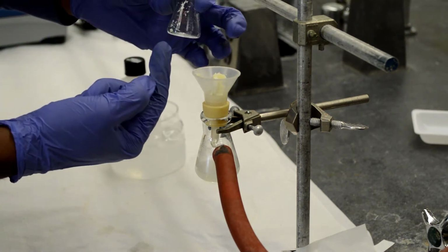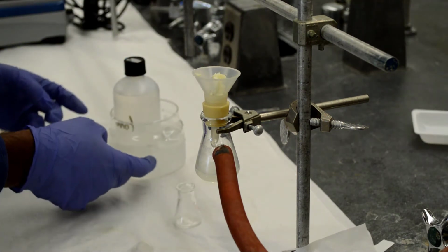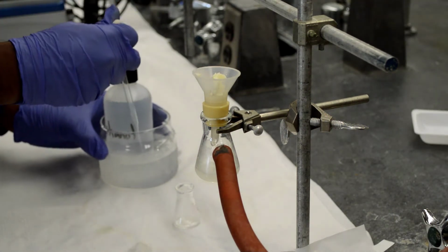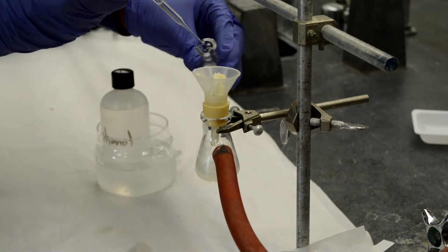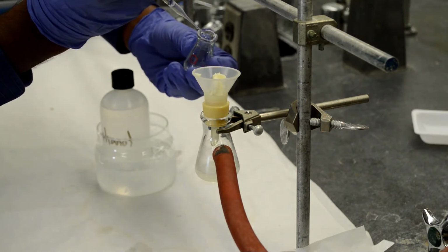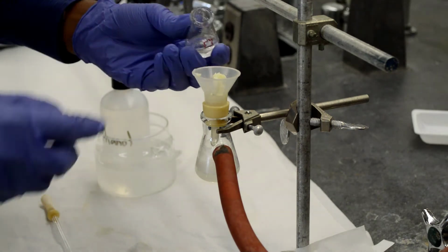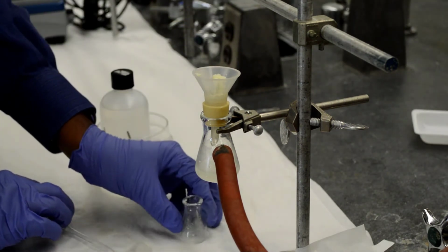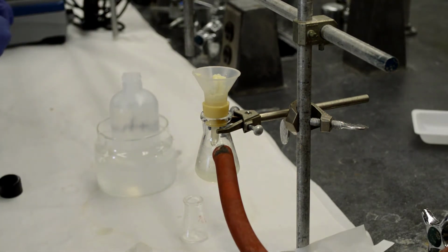And you can rinse off the remaining precipitate in the flask using ice water or ice methanol. Let's try ice water first. Take some ice water, add it to your flask on the side, and rinse your product into the filtration funnel. Now you can also try the methanol.